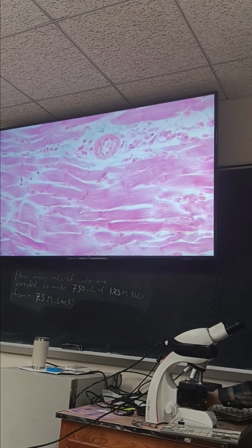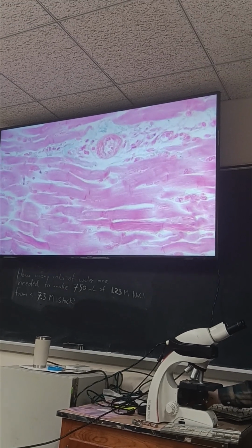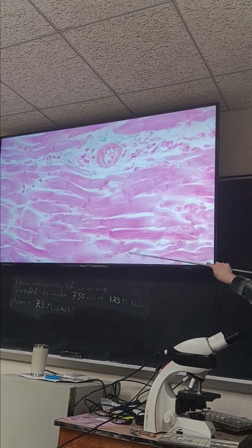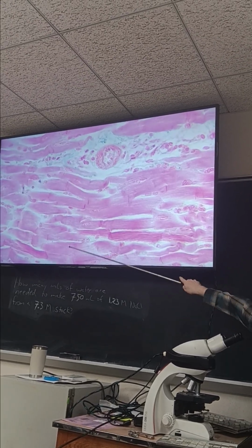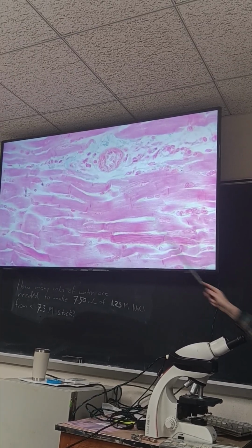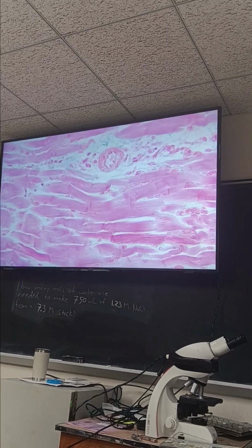They kind of look like skeletal muscle cells. I can't really show you if you're like where I'm seated. You would be able to see striations. Maybe you can see those. Over here it looks maybe decent. I don't know about the back of the room, but over here I can see little tiny stripes. So this is striated. So the question is it skeletal or cardiac?